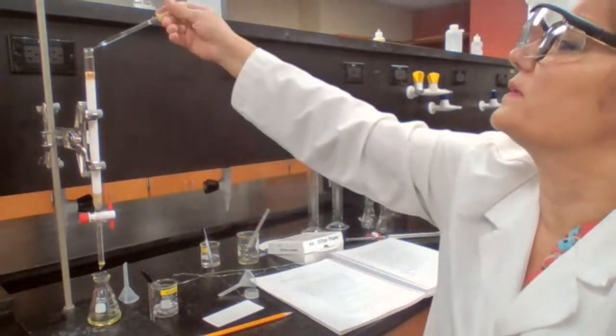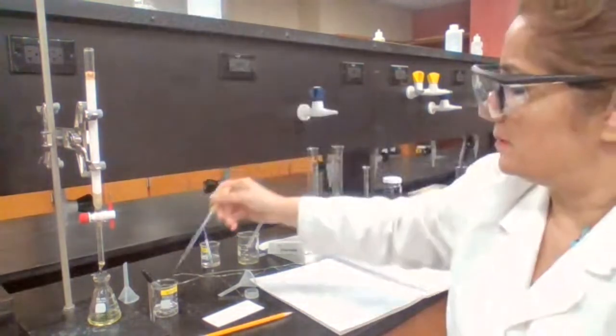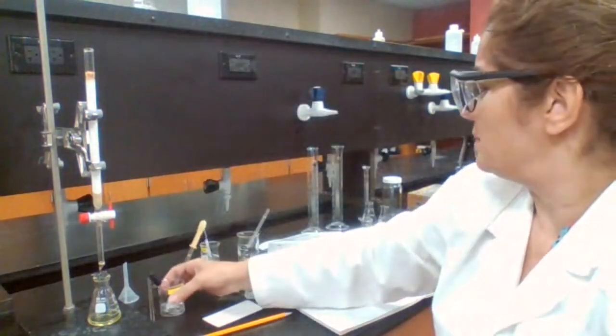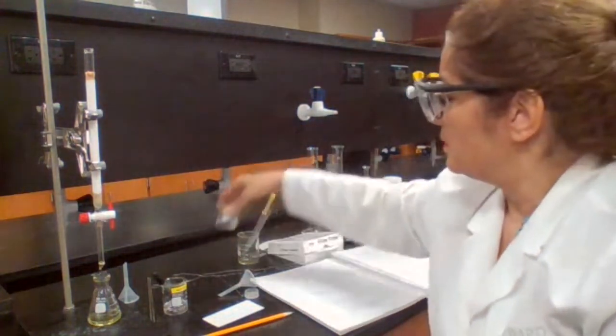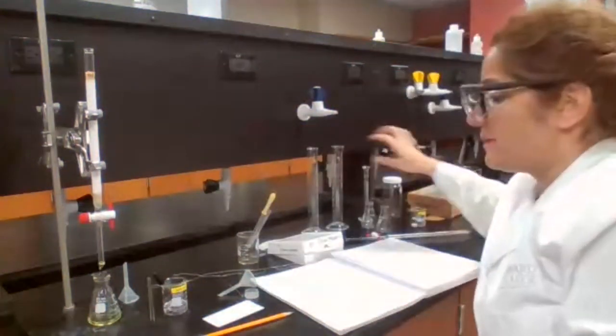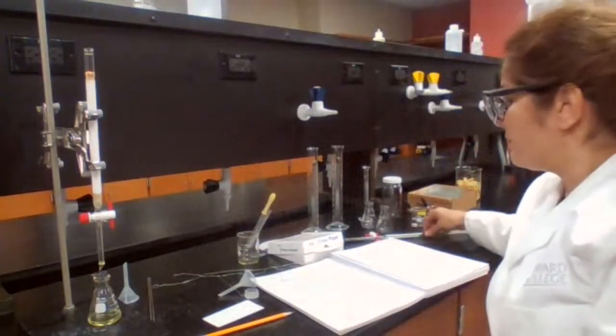Okay, I think this is the last batch of solvent that I'm adding because it looks clear to me.